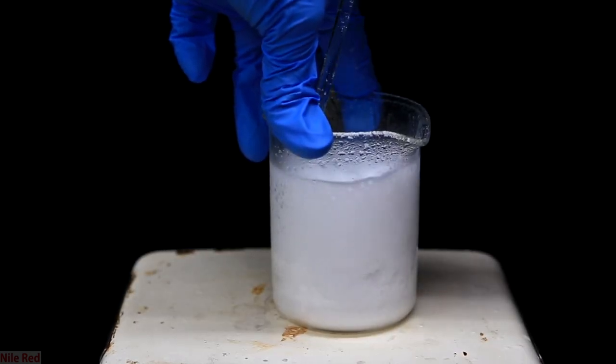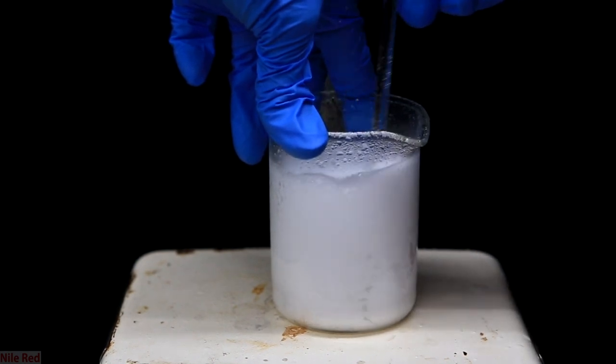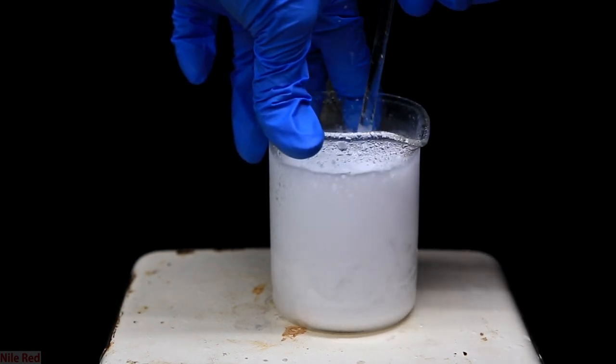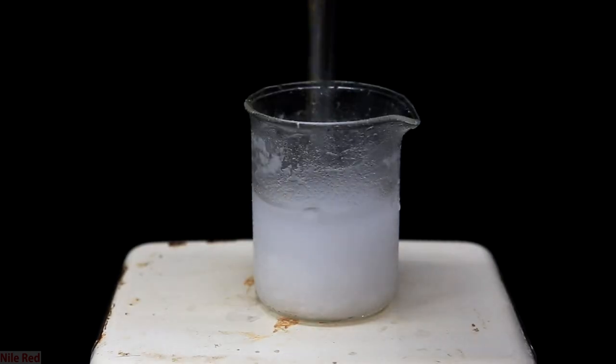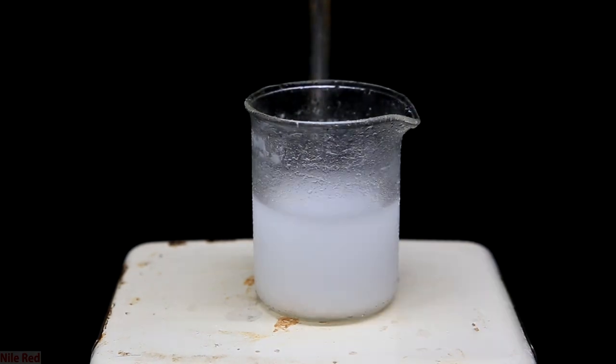So I keep repeating the same cycle of adding formic acid, waiting for the reaction to die down a little bit, and then breaking up chunks with my glass stir rod. After doing this for a while, we'll eventually get to a point where it's a lot more liquidy. Now a stir bar will actually be useful, so I add one.